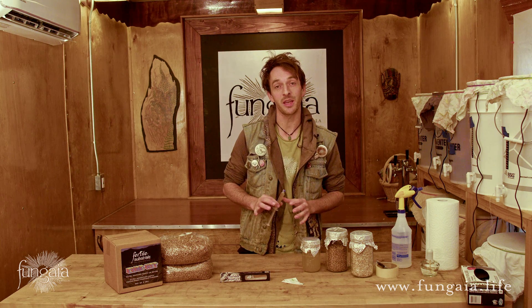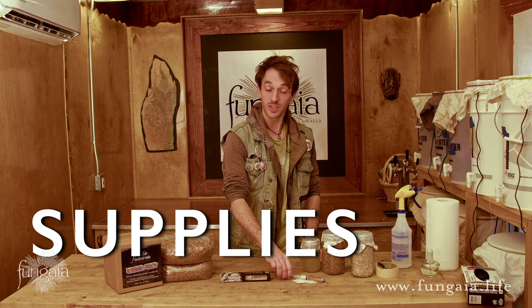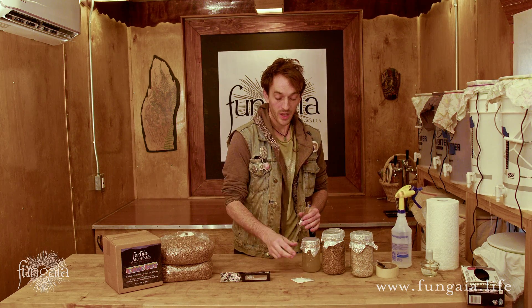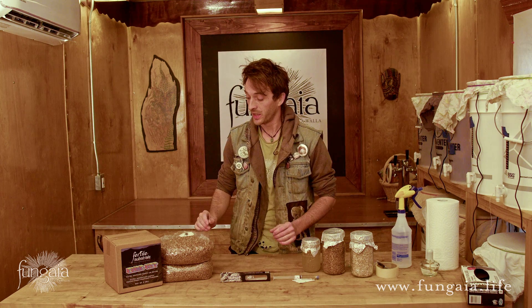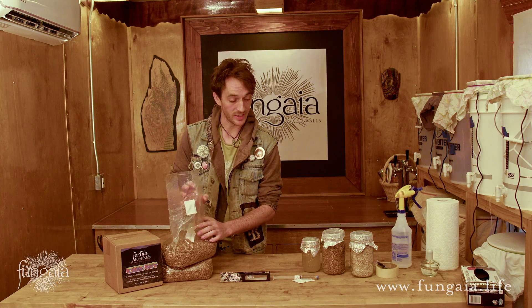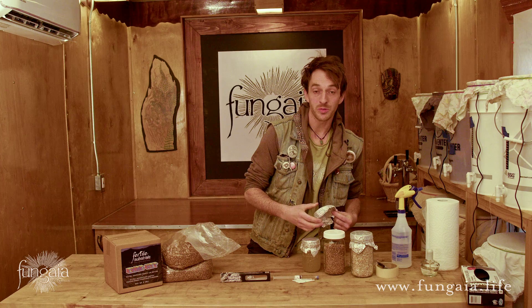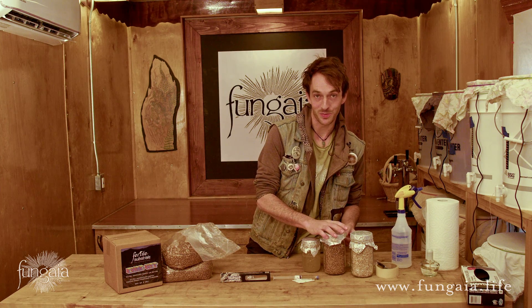Because the syringe, the needle, and the jar all remain sterile throughout the process, there's very low risk of contamination and the cultivation process is off to a great start. All you really need to make this work is a liquid culture syringe, which should always come with a sterile needle, and a jar or bag of hydrated, sterilized grain that includes an air filter and an injection site. You can make these yourself quite easily — I've got a great video showing how to make airport lids for jars specifically, so make sure to check that out.